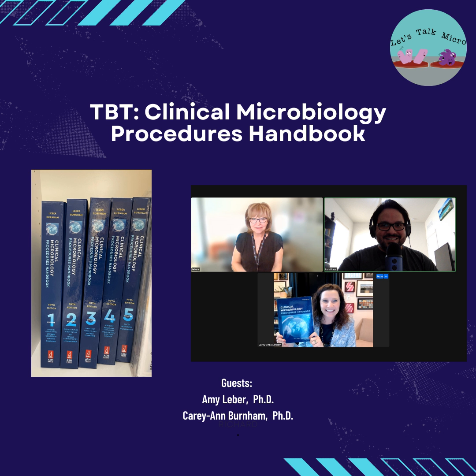These are color images, and they really add to the learning, particularly as you're learning on the bench. The colors of biochemicals or the look of something is very important. The sections that I was involved with, the molecular section obviously was updated. That's a very fast moving area. And actually SARS-CoV-2 got onto the website, we'll talk about this in a minute. It was made available very quickly.